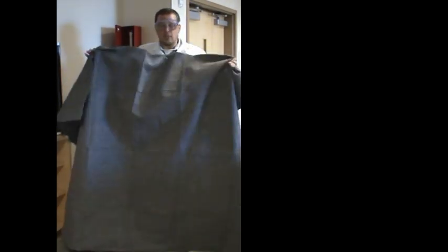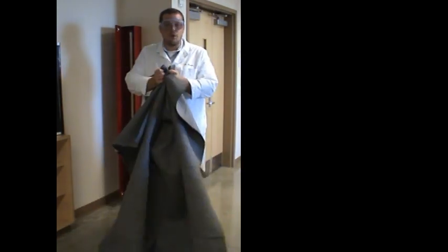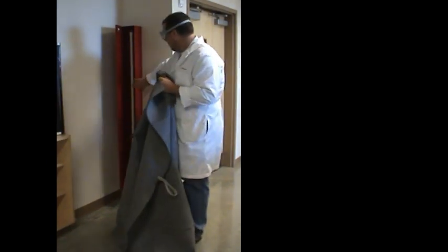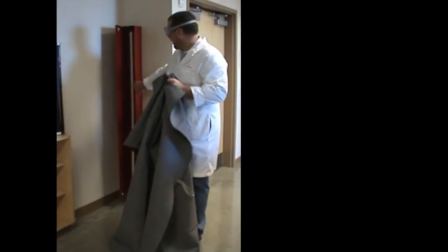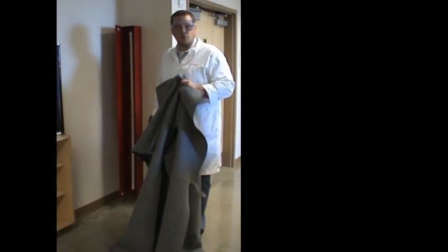Anytime there's a situation where someone might be in shock, if you need to warm somebody up, fire blankets work really well for them. So those are in the big red box, and it looks like I've got to rewind this one so it's ready to spool out if we need to use it again.